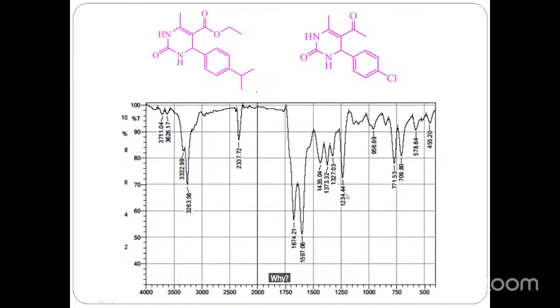Why have these two signals appeared? Is there any problem with the compound, or a problem in the instrument, or a problem while analyzing the IR spectrum? No one?